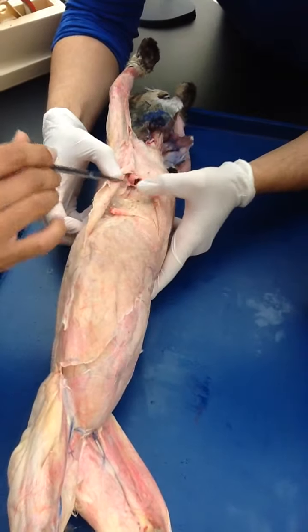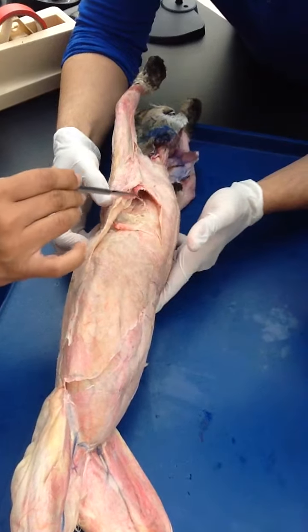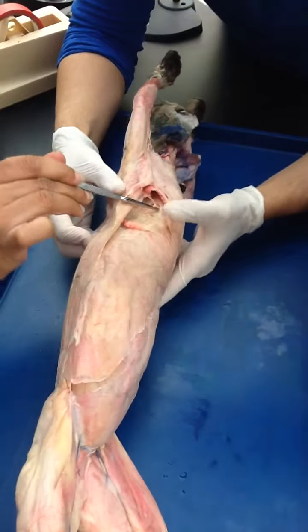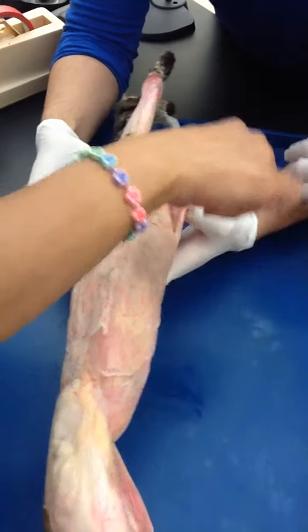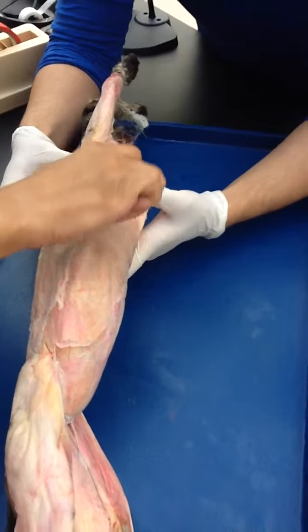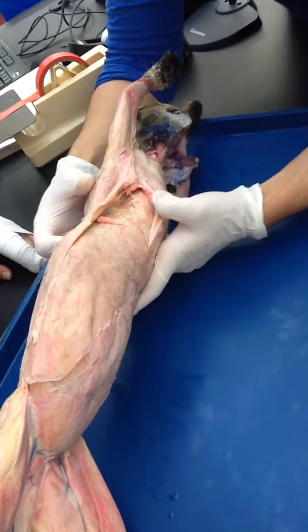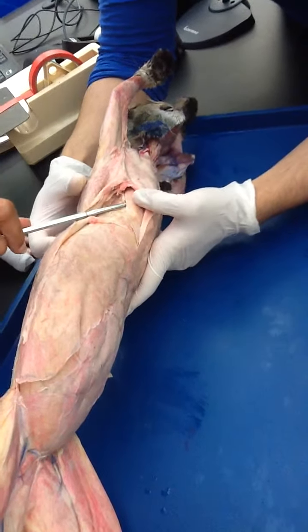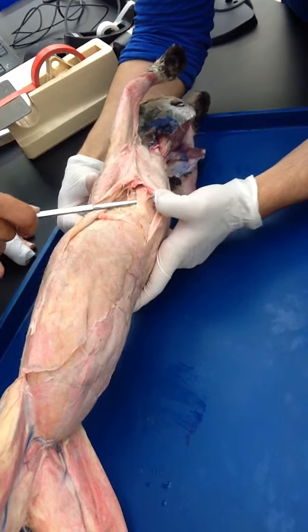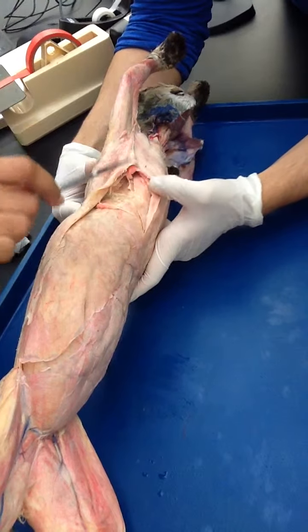There are three right here — it can be four, five, whatever number, it doesn't matter. It makes that fan shape going this way to make a triangle. You're going to pull this muscle up. This is your scalenes, and it runs all the way up. But you're not tracing it all the way up because you'd destroy the specimen — you just want to see it.